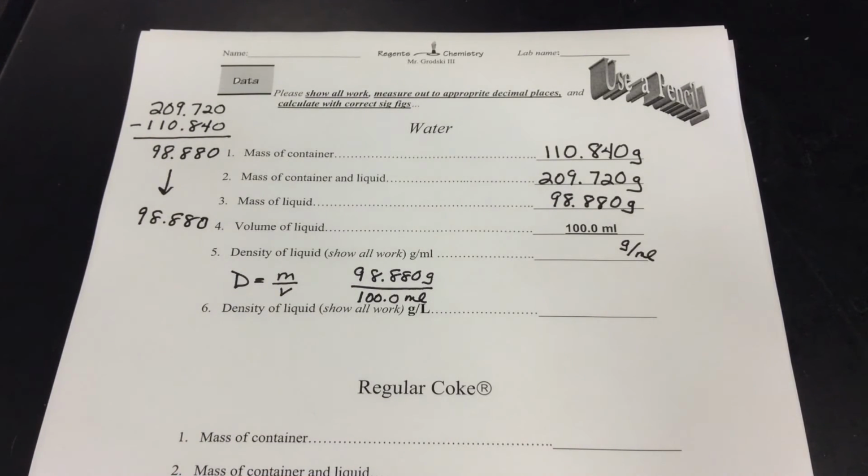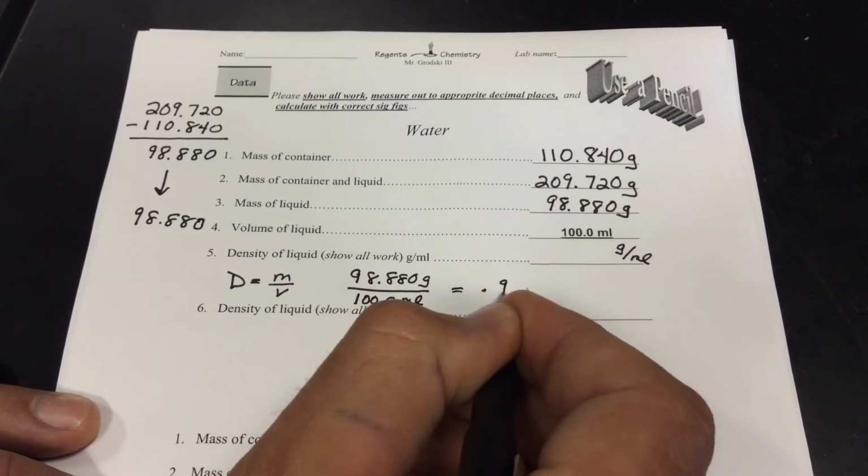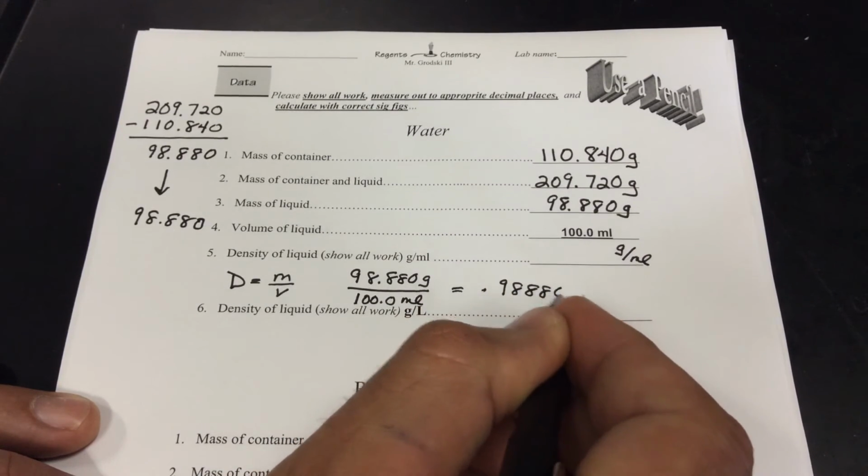And when you divide by 100, you're going to move your decimal place over a couple of places. And what we get here is 0.98880.